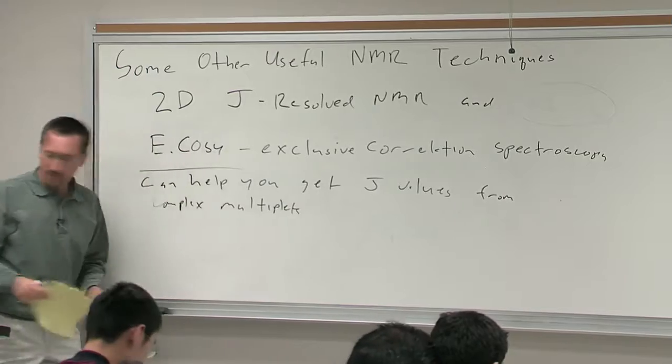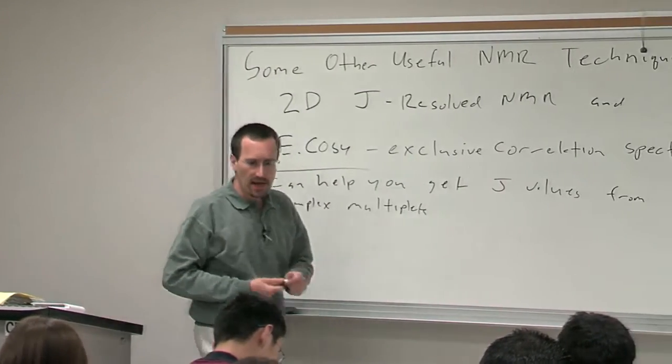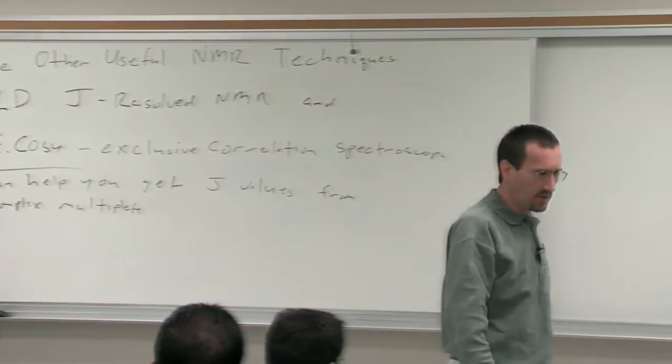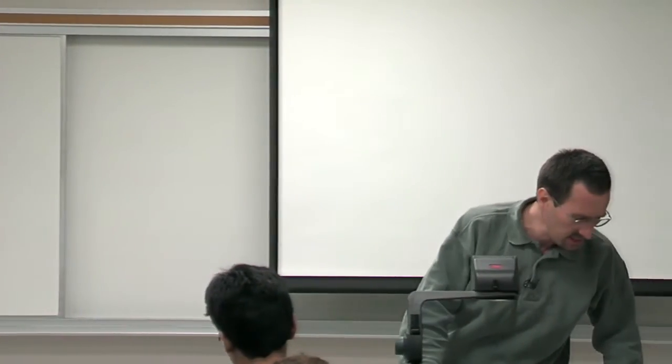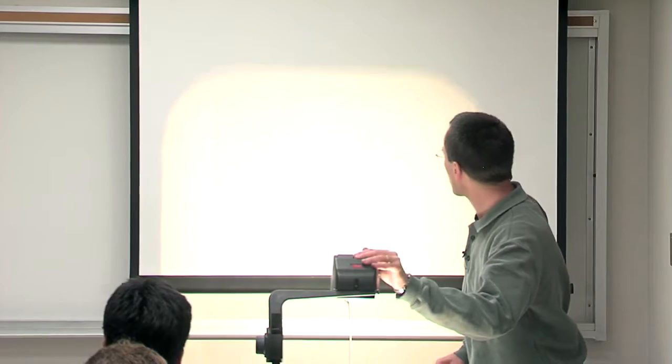And I just took a couple of examples from sources that I like. And the source that I like these days for modern NMR experiments, to the extent that I've now bought the book three times, first in the 100-and-more version, then in the second edition, which was 150-and-more NMR experiments, and now in the 200-and-more NMR experiments version, is this book here. And I'll just show you very briefly the two types of spectra here.